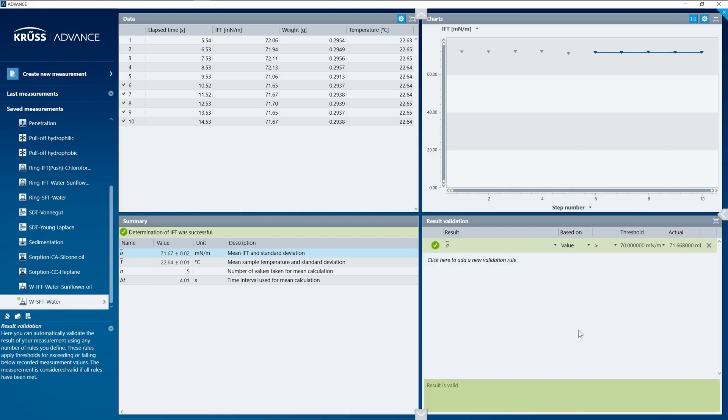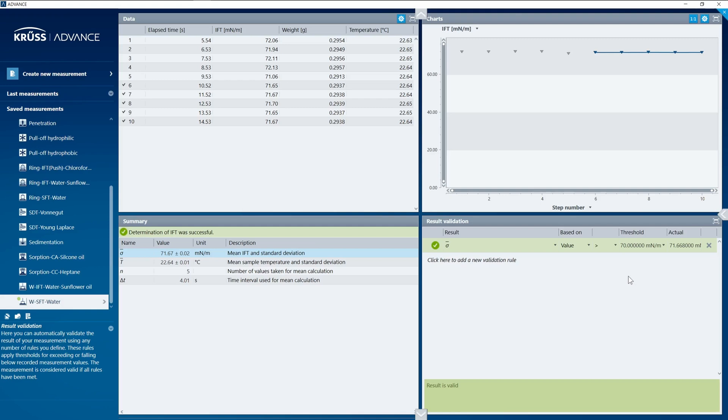And to the right here I've set up a validation step. Now normally surface tension of water should be about 72.8—in this case we were happy with 70. So we set a validation step of 70 or higher, and we can see it's lighting green because my surface tension was within that range.